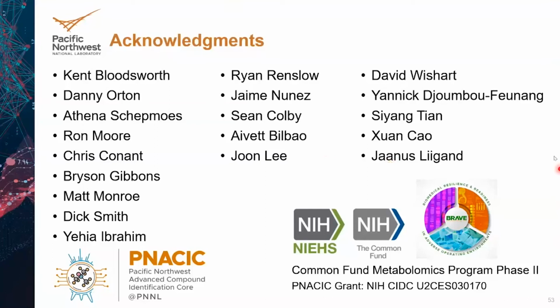At the end of the day, experiments have to be conducted to validate the target. So how can confidence in picking the correct molecules be high? Yeah, so if I interpret the question correctly, you've identified 11,000 proteins. How do you then down select to where you think the action is in terms of biology? There are a number of ways you can do that. You can look at volcano plots of the molecules of interest or the data. You can look at the correlation of fold change and p-values and so forth.